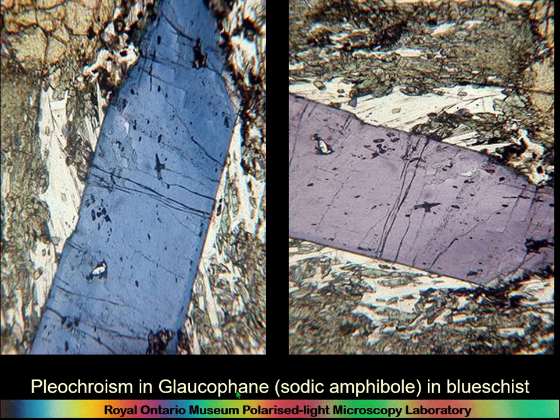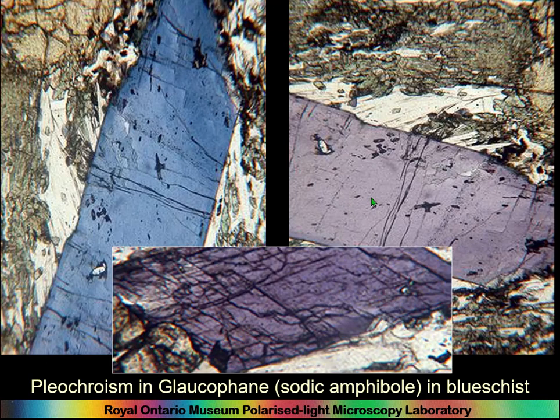I've never actually seen this in a pottery thin section. I have seen it in rock thin sections. But if you ever did see this and you think, what on earth is this wacky mineral which is turning blue to purple? One of the things you'd be looking for, of course, would be this. And you can see this purpley mineral has 2 cleavages at 120 degrees.